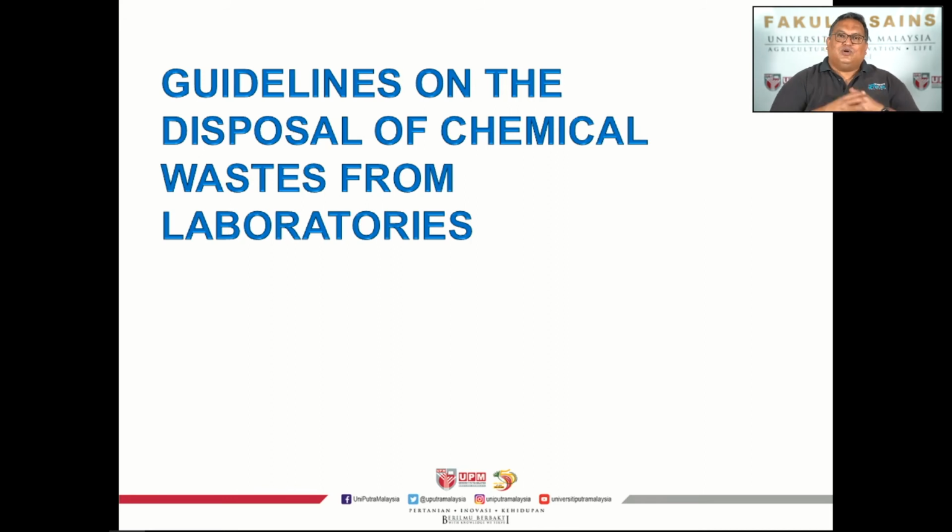So the next one is we want to talk about waste. Of course, when you do chemical reactions, you're going to produce waste. So what do we do with this waste? I think this is one of the most important things that any researcher should think about when they start doing research: what am I going to do with the waste that I'm going to generate?